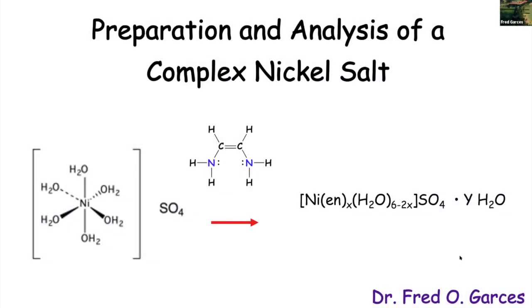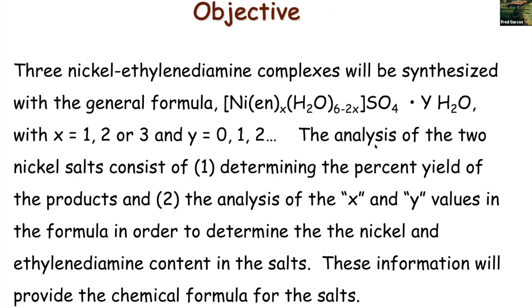Made it. So this is your synthesis. The synthesis will require you guys to take this salt, add ethylene diamine under certain conditions, and then get 3 possible salts out. Okay, so this first part is just the objective.